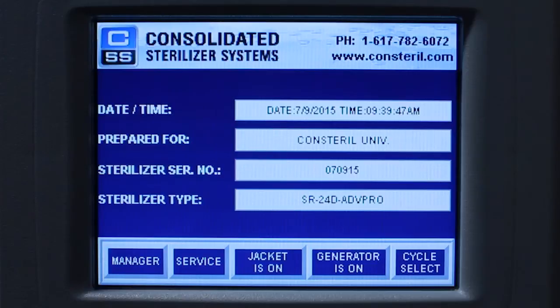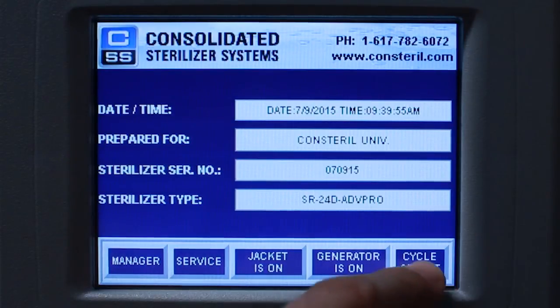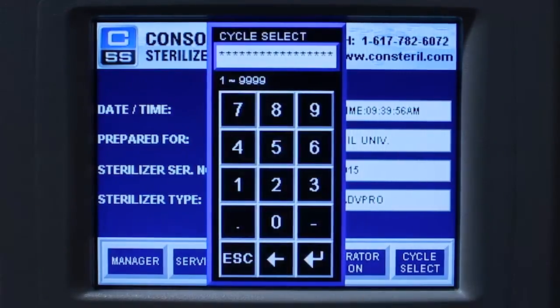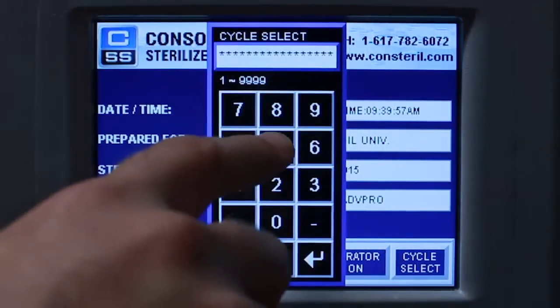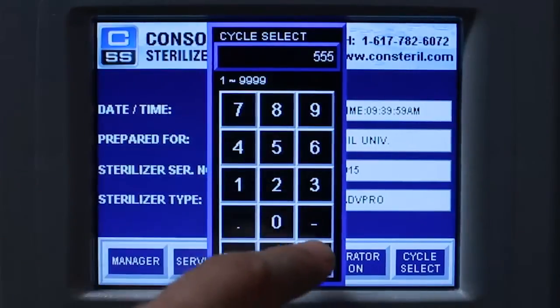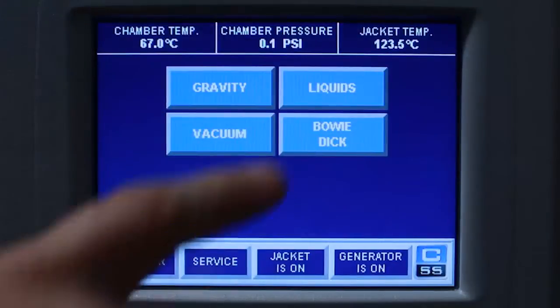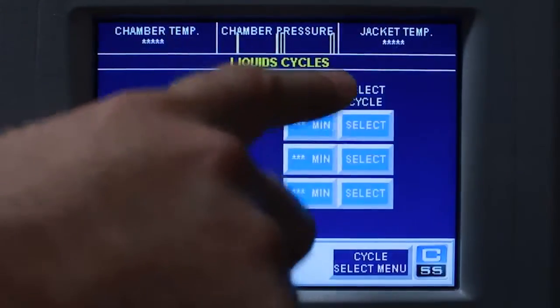To start a liquid cycle on the Advantage Pro control system, press the cycle select button on the main menu. Enter your operator passcode on the number keypad and press the enter key. Select the liquids option.